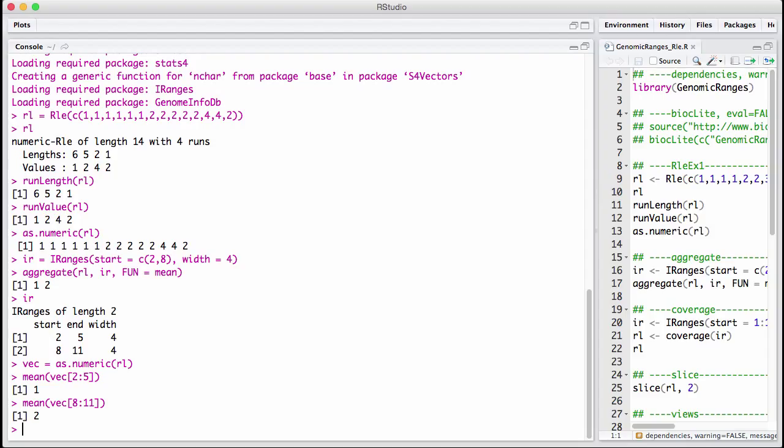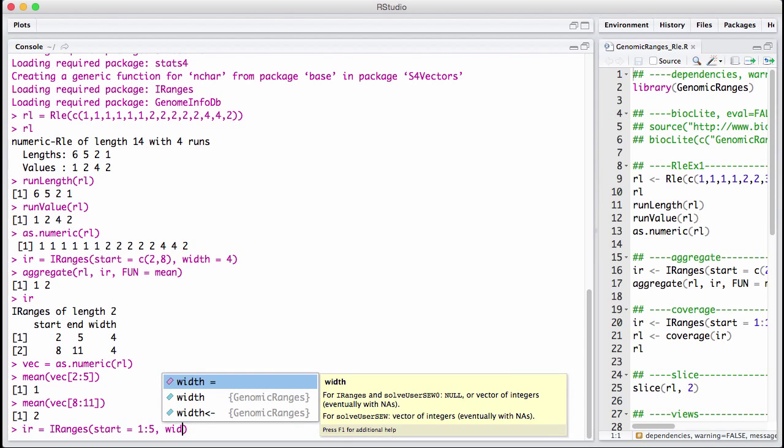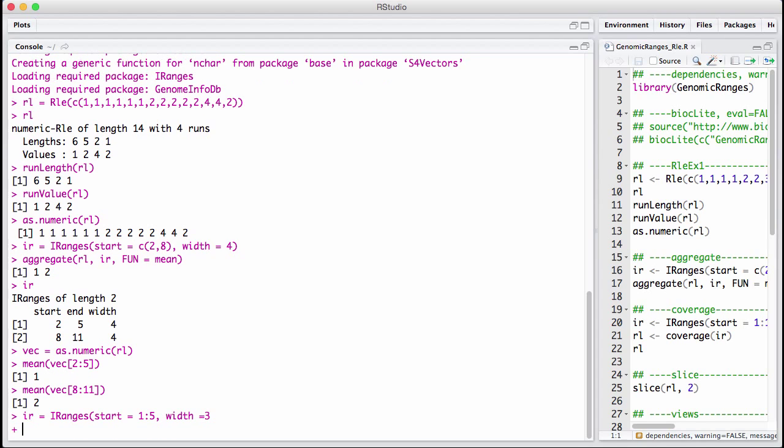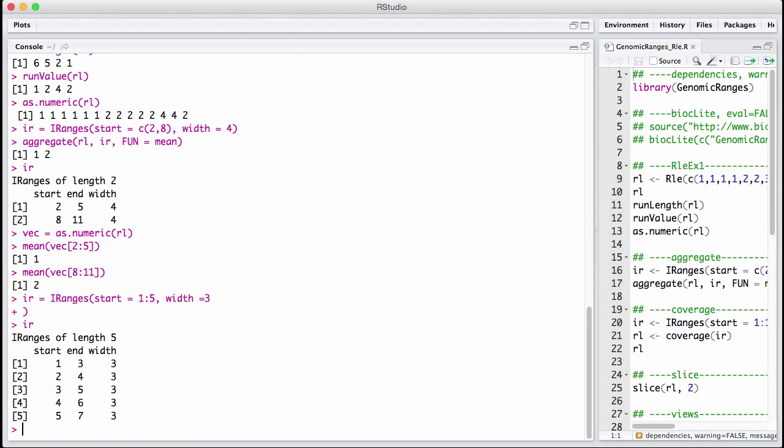You can construct a coverage vector out of iranges. That can be useful sometimes. So let's say you have our iranges. Let's make a new iranges. So I have these overlapping intervals. And I can say, what's the coverage of this? By which I mean, how often for integer number 1, how many of these ranges is it part of? For integer number 2, how many of these ranges is it part of?